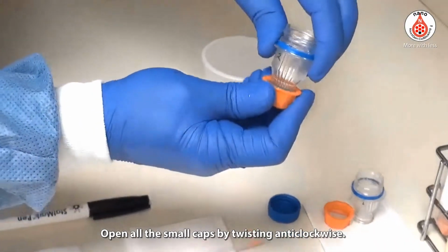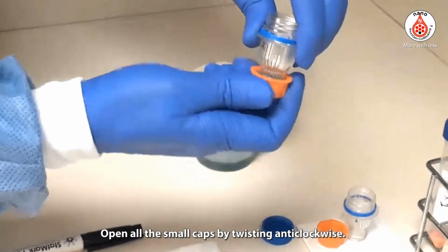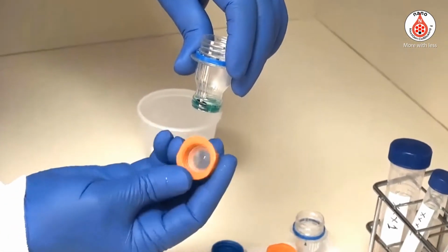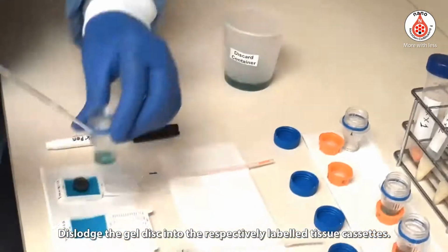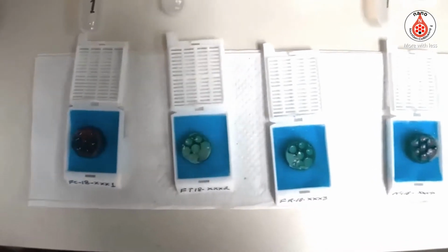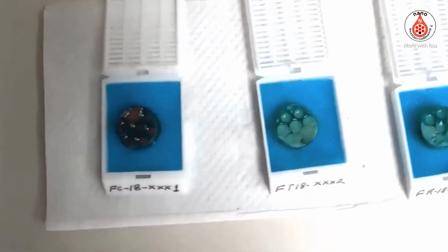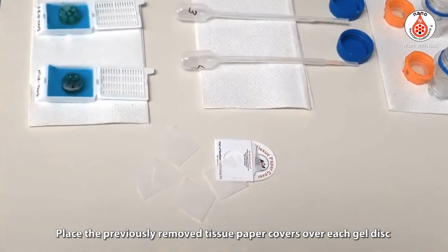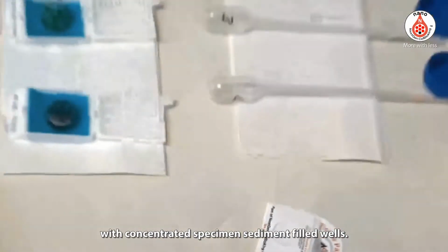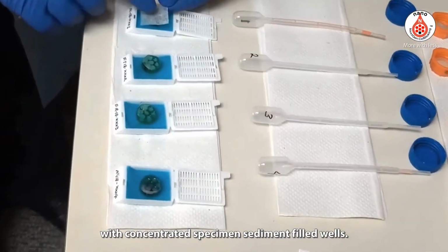Open all the small caps by twisting anti-clockwise. The washers usually come out with the small caps. Dislodge the gel discs into the respectively labeled tissue cassettes. Place the previously removed tissue paper covers over each gel disc, with the concentrated specimen sediment-filled wells.